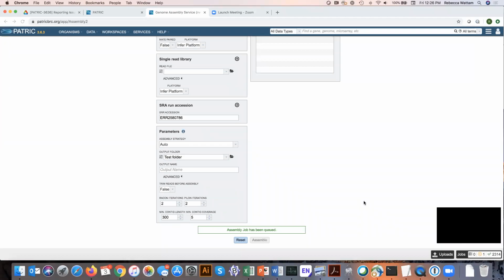We just submitted our assembly job, and in this video, we're going to talk about monitoring the job progress and looking at the results. So the job has been submitted. It says here it's been queued. How do I find information about that job?